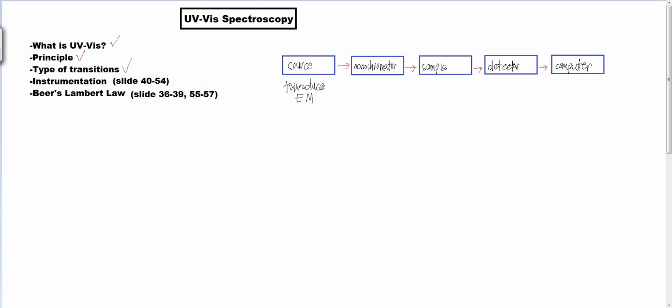So that means the electromagnetic radiation, usually in the range of the UV and also visible lah. Like I already mentioned, it start from 200 until lebih kurang dalam 800 nanometer macam tu, right? Because I already explained UV and also the wavelength for the visible also.